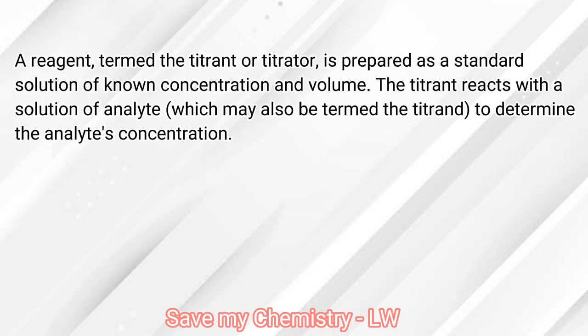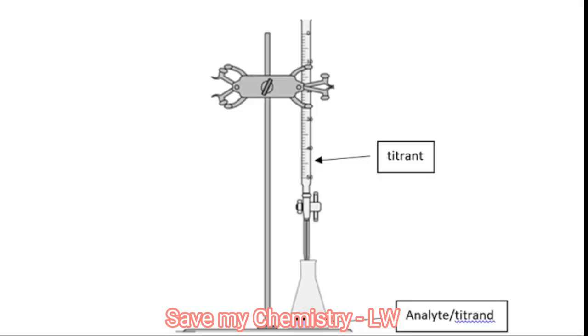A reagent termed the titrant or titrator is prepared as a standard solution of known concentration and volume. The titrant reacts with a solution of analyte, which may also be termed the titrand, to determine the analyte's concentration. See the figure on the screen. The solution inside the burette is the titrant, and the solution inside the Erlenmeyer flask is the analyte or titrand.